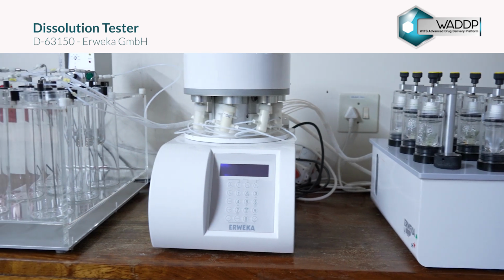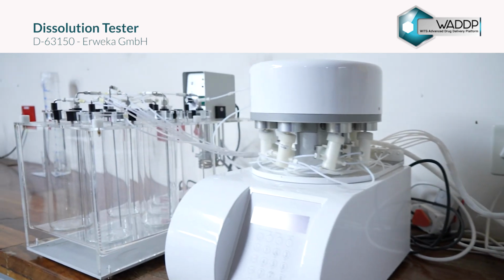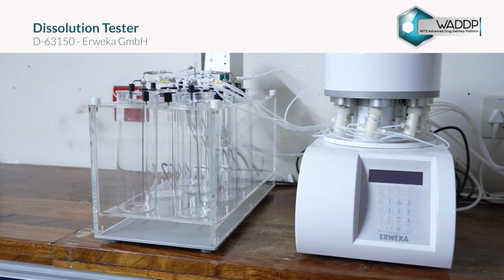A dissolution tester is used to assess the rate and extent to which the active drug ingredient is released from an oral dosage form, like a tablet or capsule, and dissolves into a liquid medium.